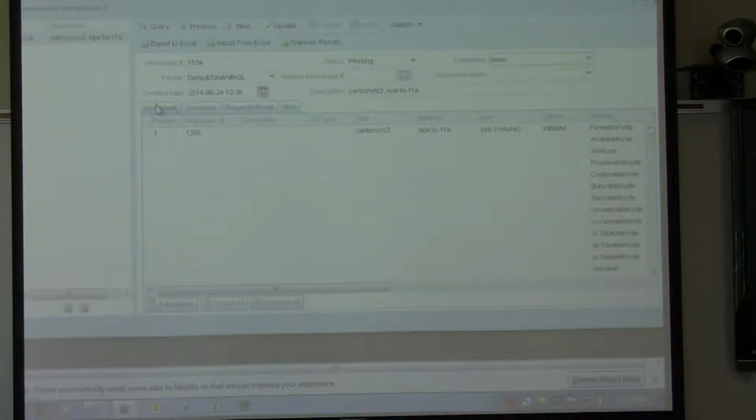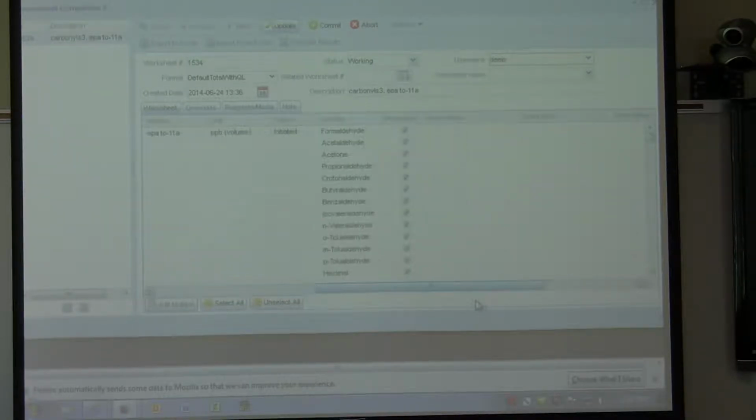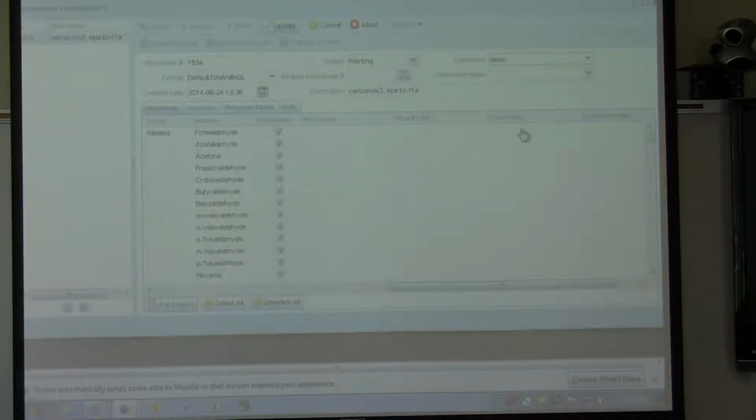So you come in, you say, hey, I've done all my work, I want to actually start putting in results. So you click update, just like before. You don't have to do the other thing. We've got, actually, I'm going right into it, aren't I? Yeah. In place edit. If you don't have any formulas, like in your Excel files, if all you're doing is just putting numbers in, we now have the feature that you can just edit it right in place. So if I want to just put in a couple values here, put in 20, put in 40, 300, 15, and just start going down the line.